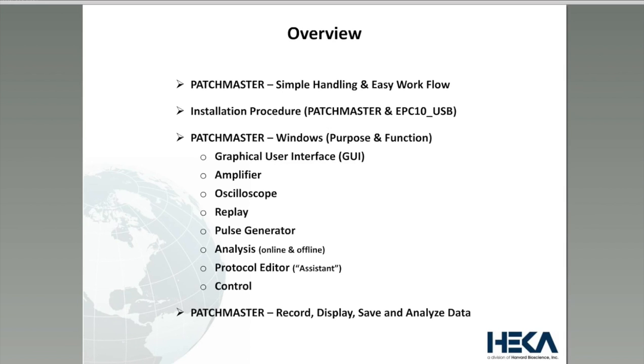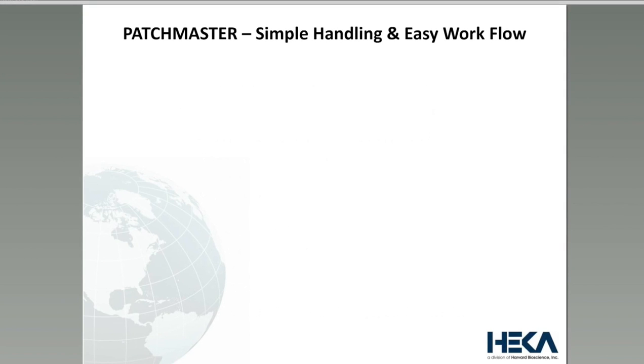Now, this is a brief overview of the PowerPoint presentation. I will start off with an overview slide that explains a little bit about the handling and the workflow in PATCHMASTER. Then a brief introduction about the installation procedure, which is pretty straightforward. Then we will talk about a couple of different windows of PATCHMASTER. Each window has its own purpose and function, and we will get into those in a minute. I will finish the PowerPoint presentation with an overview slide that demonstrates how to record, display, save, and analyze data with one click.